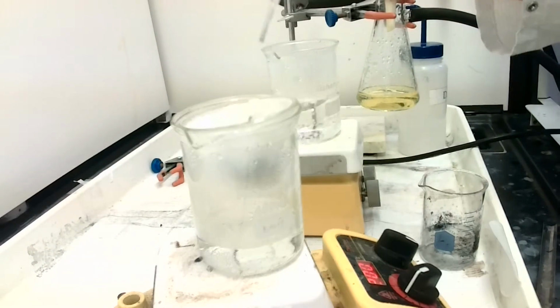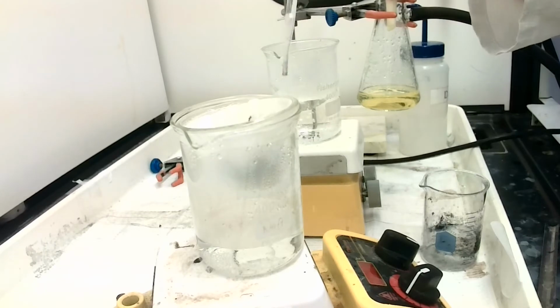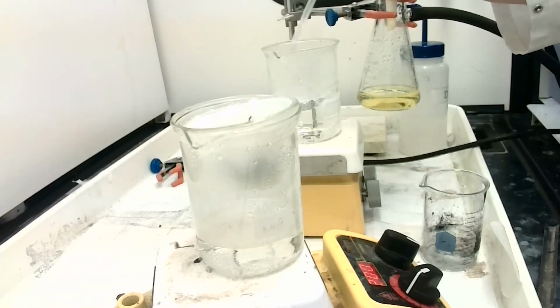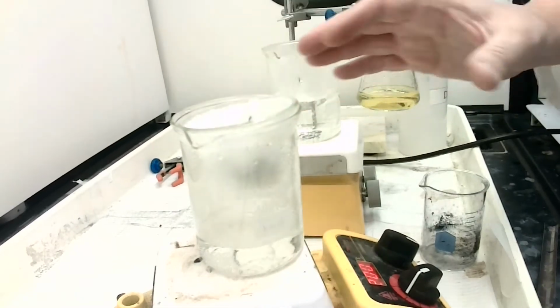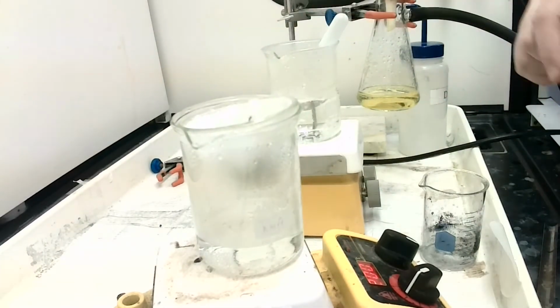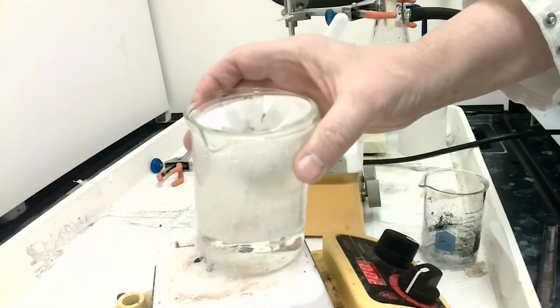Okay, looks like I squirted down. Now one of the things we're going to do at the very end after we've collected our final product is re-examine this paper once it's dried and see how much of our crystals actually are still stuck in the paper.